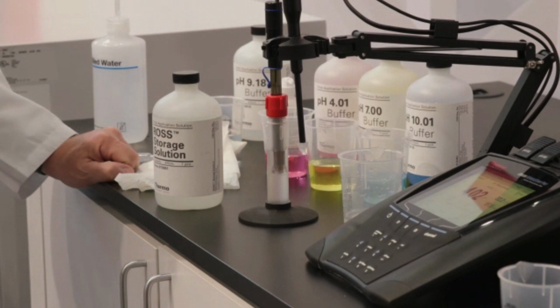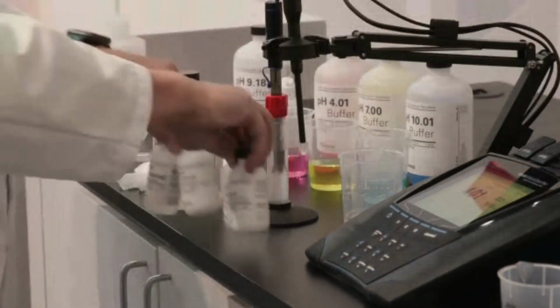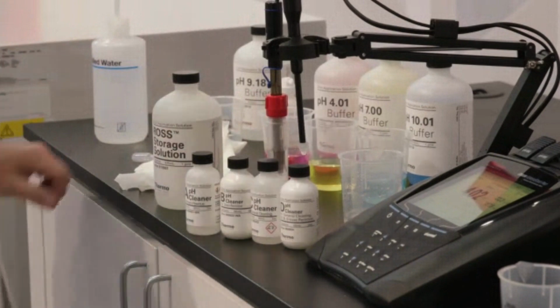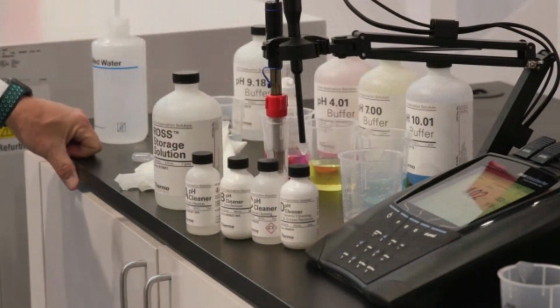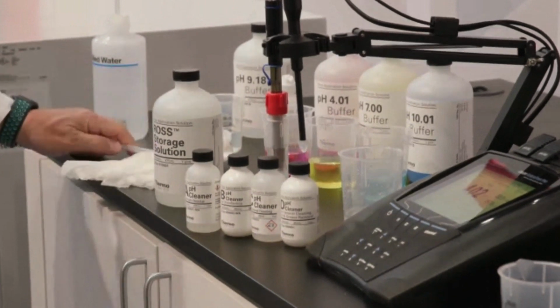We have mentioned not putting a dirty electrode away, so there are some simple ways to clean our electrode. We can simply rinse it with a 1% laboratory detergent solution, or if we want some more specific cleaning, we do sell a kit that has one bottle each of our cleaning solutions.